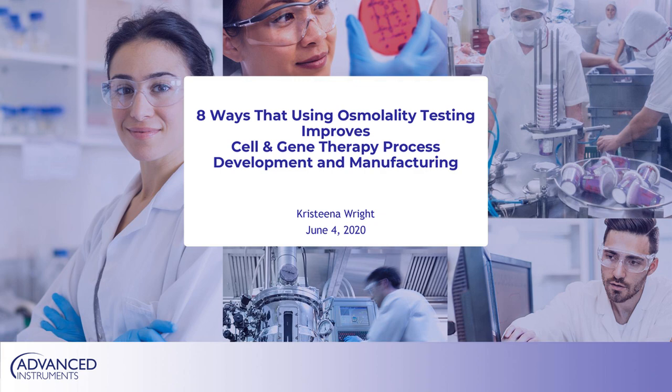So what I'd like to do today is share some new learnings. As you said, we really value our relationships with different key opinion leaders in the field and some of our customers. And we like to share some thoughts on different emerging and more novel use cases for osmolality testing within cell and gene therapy. And really just start a conversation, a discussion about what are some thoughts from some of you that are listening. As we start to investigate a little bit closer and start working more towards getting some projects started and getting scientific data, which ones are really appealing to you and what's most valuable to the customers?